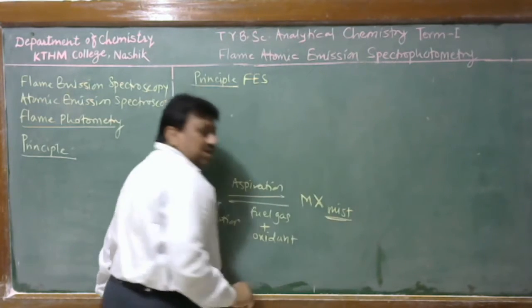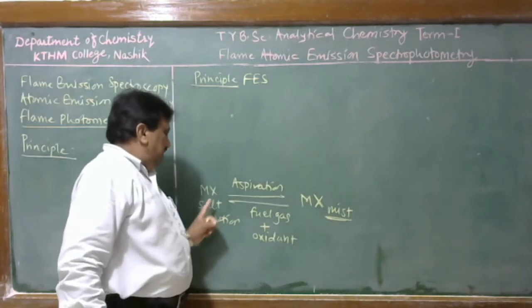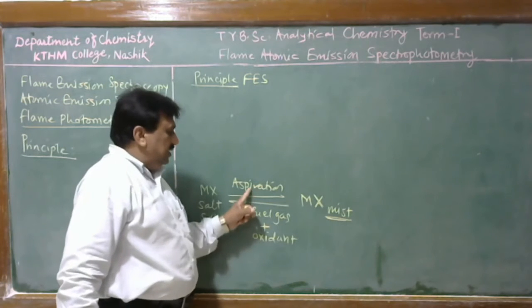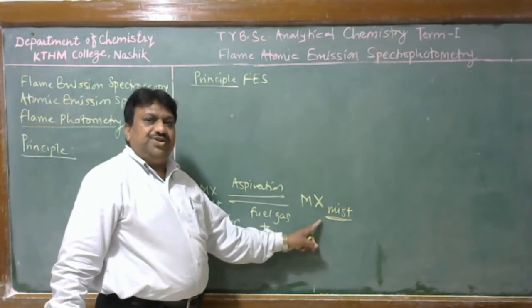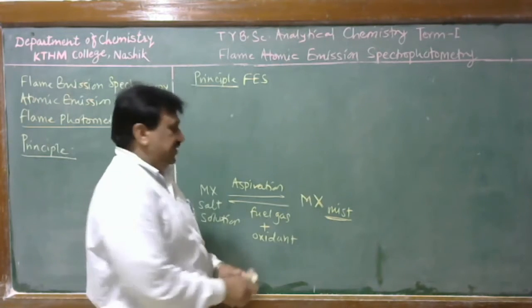Mist, that is a fog. That means a sample solution with the fuel gas and oxygen. This mixture results in formation of fog, and that is called mist.